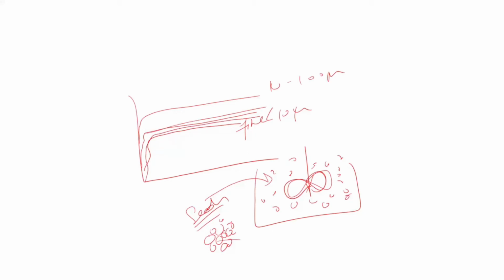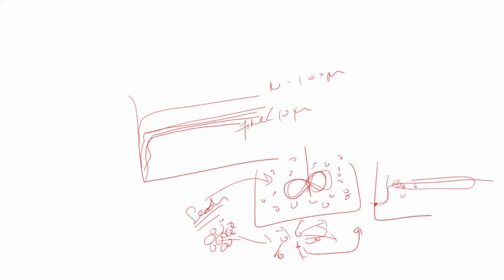Everything will break and become single particles, and this we can monitor in the FBRM. At the beginning it will be like 50, and then once the impeller breaks these particles and converts them into single crystals, you will get the real numbers here. Then everything will look constant after this point. So that's the purpose of FBRM.